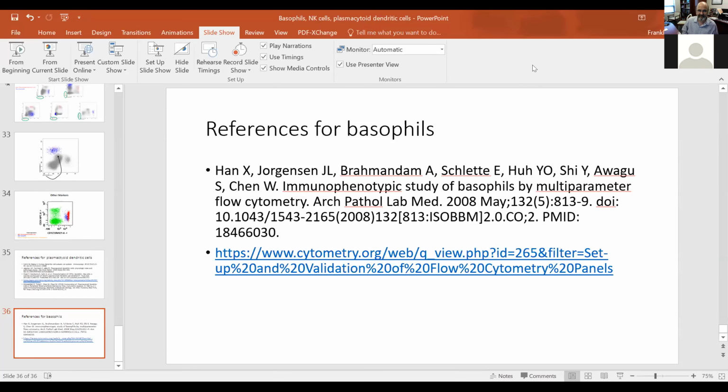All right, buddy. Thanks a lot. So this is a fairly difficult topic to put together. So you did a really great job in describing these populations that people don't think about all the time. But certainly, like you mentioned in MRD analysis, these can create diagnostic issues. And there's a lot of variability in the phenotypes that all these three populations can show even under normal circumstances. So you warned us about not jumping to conclusions about them. So thanks a lot. And let me see here, let me stop recording.